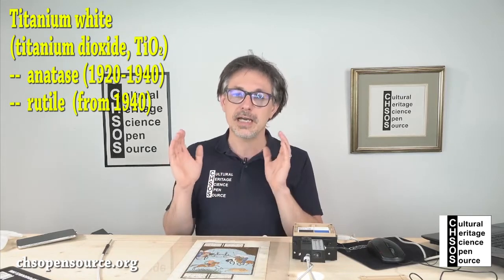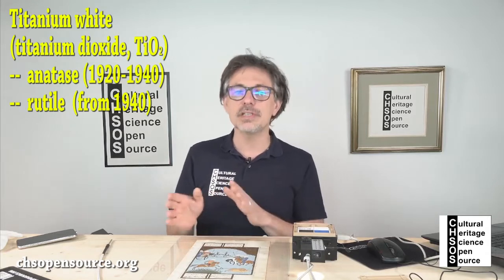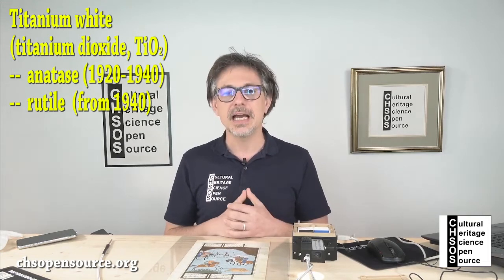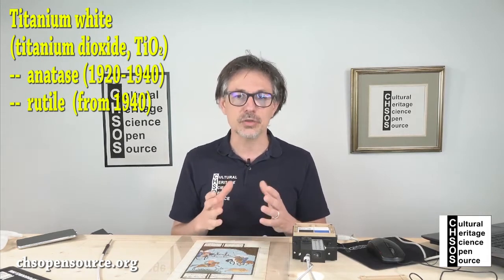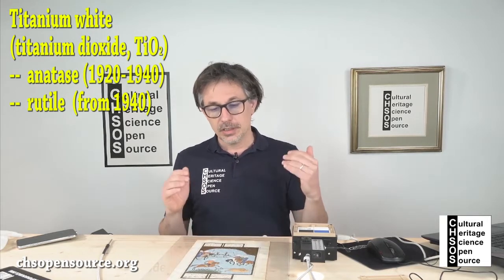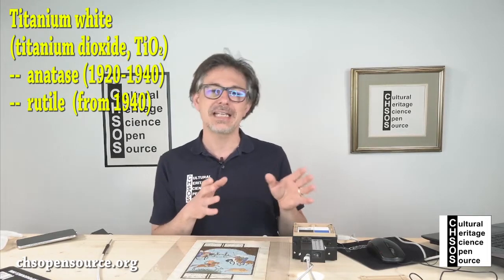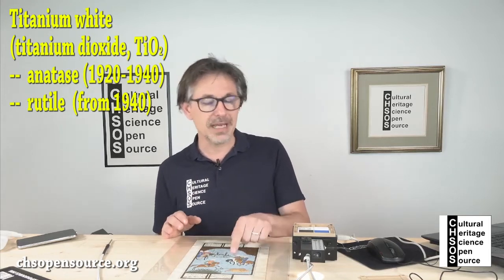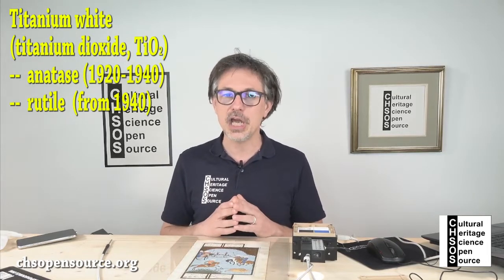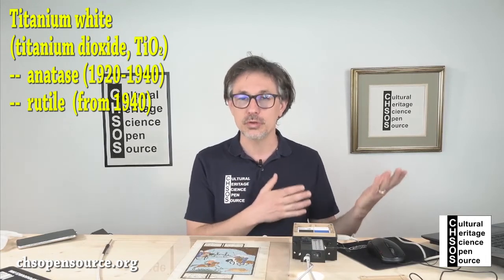So being able to distinguish between these two forms of titanium white allows us to actually perform a dating of the object. Titanium white anatase, the first form, was introduced in the 1920s. So from XRF we found titanium white, so definitely the object is not as old as it was supposed to be.